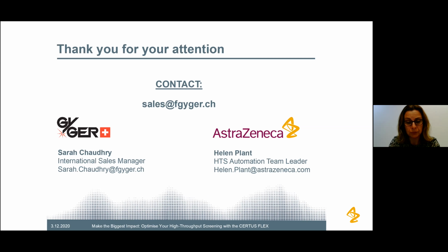Okay, we have another question. Helen, do you do any cell-based assays? Yes, and some of the data I've shown you there was from cell-based assays. We've used them for cell plating, and actually see no difference in terms of reagent. We've not particularly met any problems. I think where you can potentially run into issues is when you've got a very high proteinaceous solution. So if you've got cells in a very rich medium, I could envisage that you might have issues there.